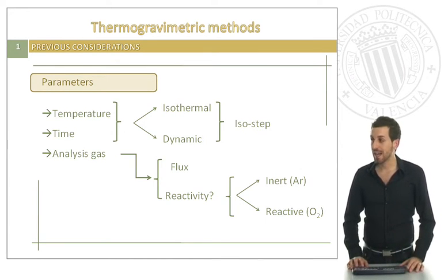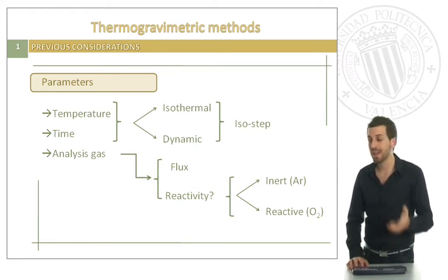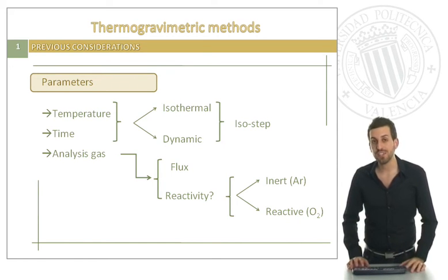Regarding the gas that we use for our analysis, we have to define, first of all, which is the flux. That means the amount of gas per time unit that you are applying. And most important question, do we want the gas to react with our sample?